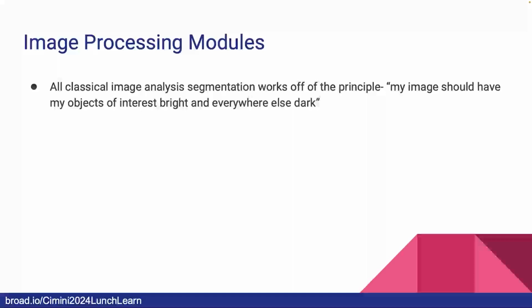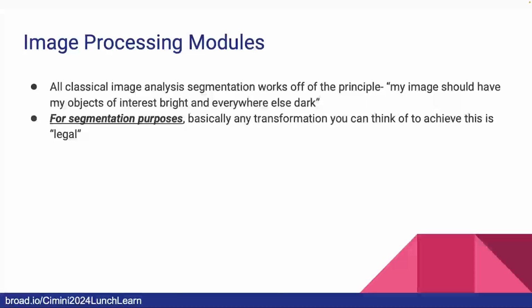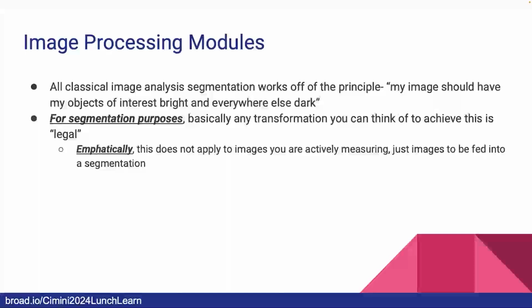And so in order to do that, it is fine to do transformations on your images. You can do any transformation you can think of, and that might mean doing something like an elastic pixel classifier, or there's lots of other things you might do to transform your image so it looks like that. This does not mean you can then measure that image that you might have done crazy stuff to. Please do not do that. Don't be like, Beth told me I can do whatever I want and I can measure these images that I did crazy things to.